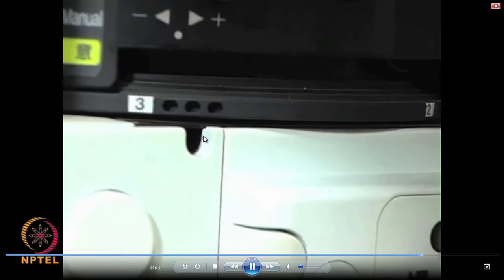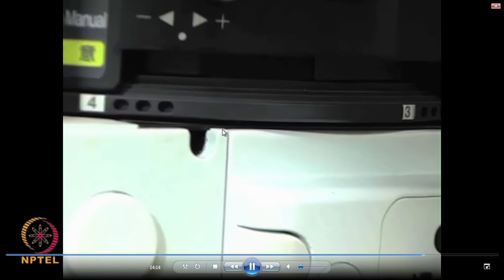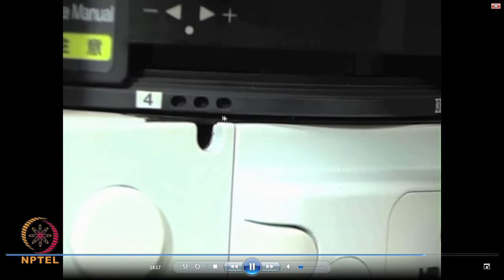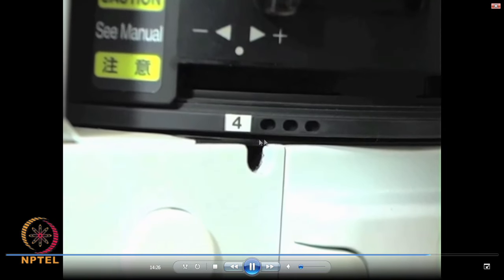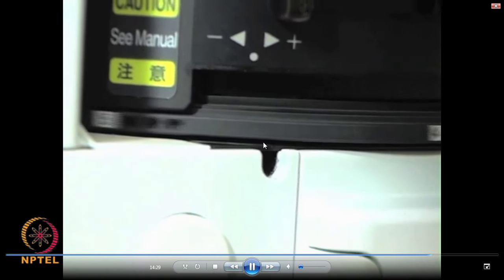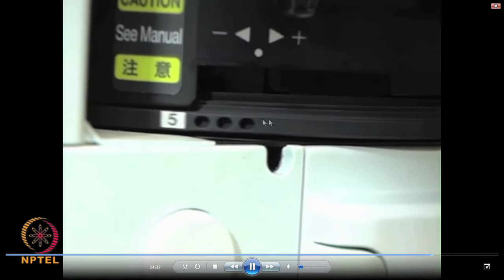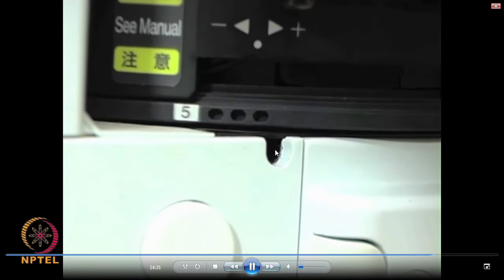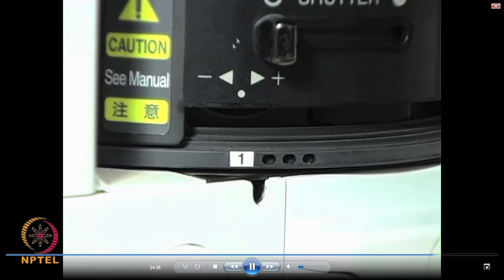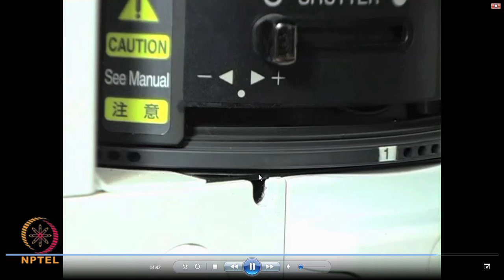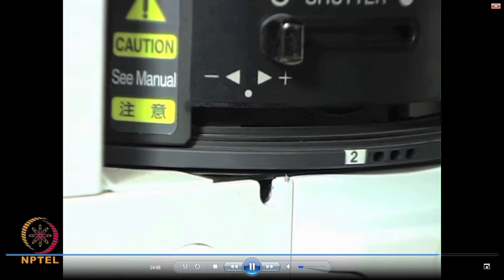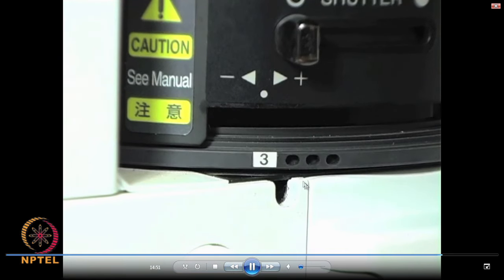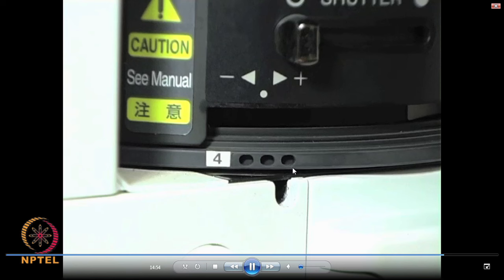You should keep both the condenser apertures and filters — above and below the objective — on the same position to perform a particular mode of operation. For example, if you are going to operate bright field illumination, you choose condenser window 4 or 5 below, and similarly you have to rotate the condenser lens above the objective also to 4 or 5 — then only your mode of operation will be correct.